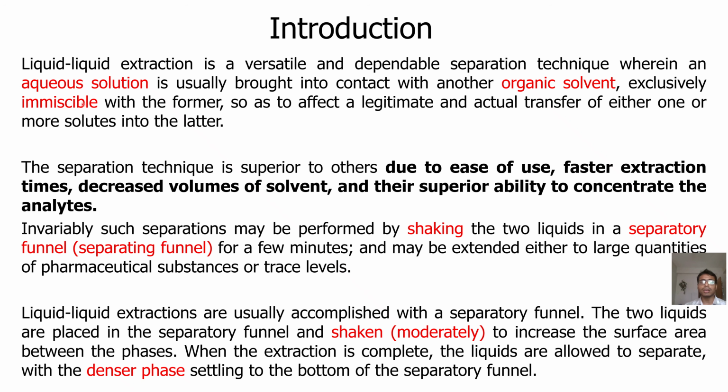Then what will you do? You will mix this methanolic extract with some hexane, and you can have separate layers of methanol and hexane. That means your compound, based on its lipophilicity, would be distributed between the two solvents.